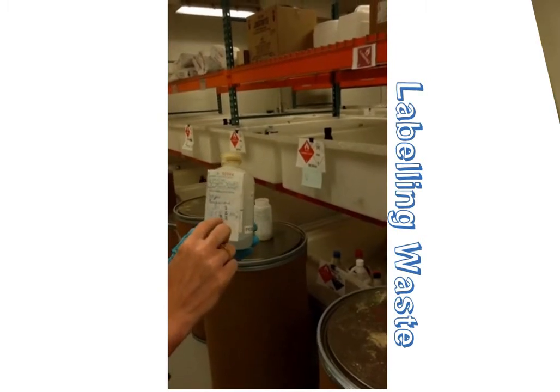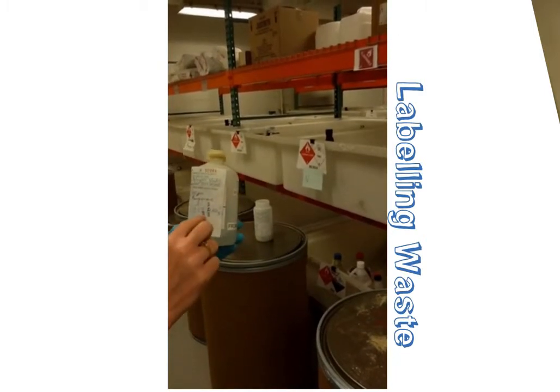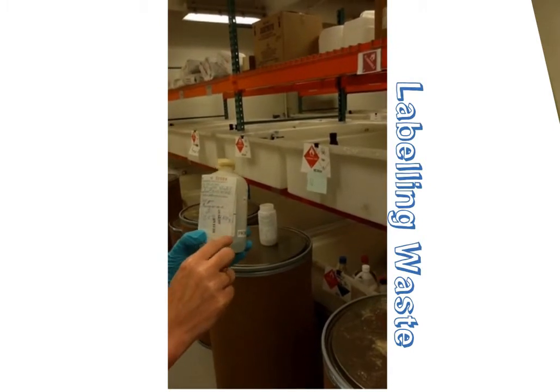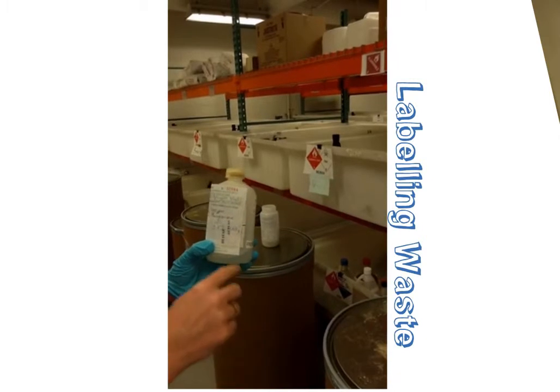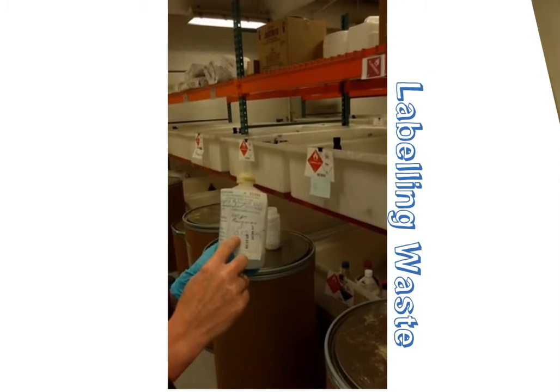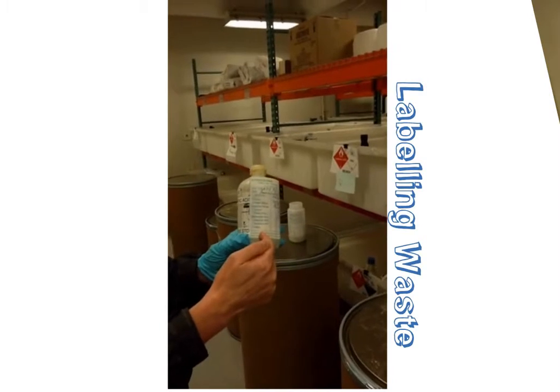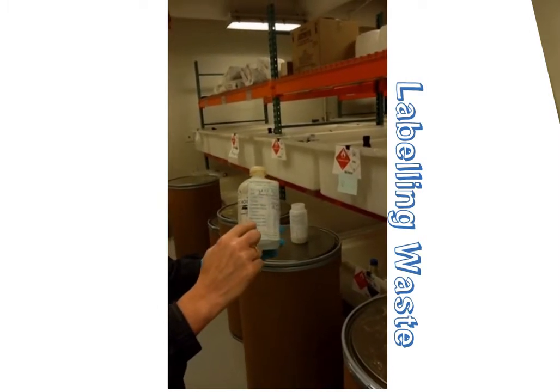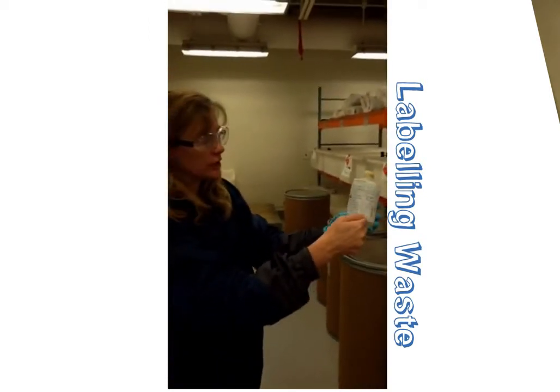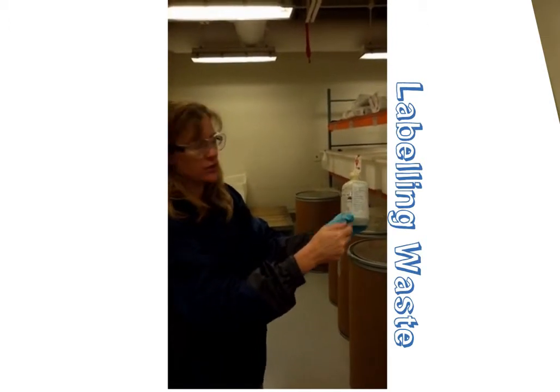What is even better, for those of you who have sloppy handwriting, is to write out nitric acid, because often abbreviations are well known in a specific lab, but not to anybody outside of the lab. So we know that that is nitric acid. We also have a percentage. Percentages are very, very helpful. And also, again, on the left side of the waste label, they've checked off what that is. So if you have a combination of constituents in the solution, checking off what categories of waste those fall into is also helpful for us.